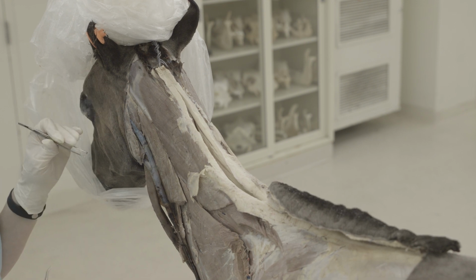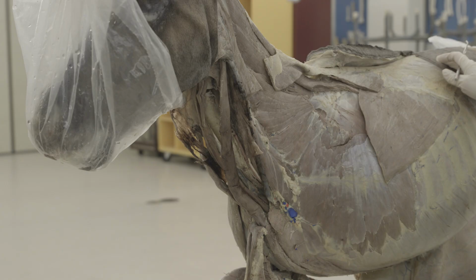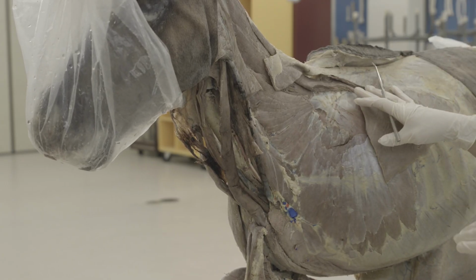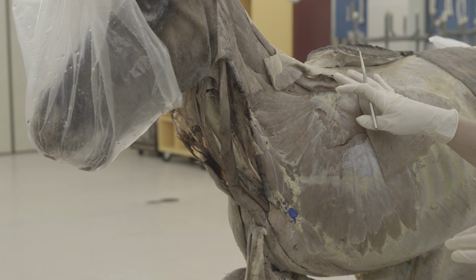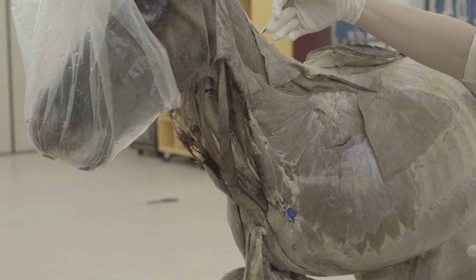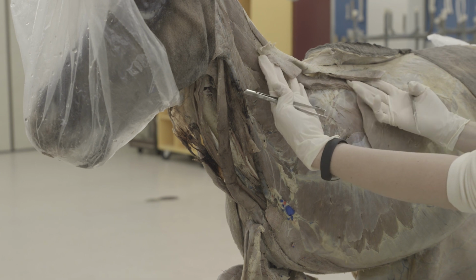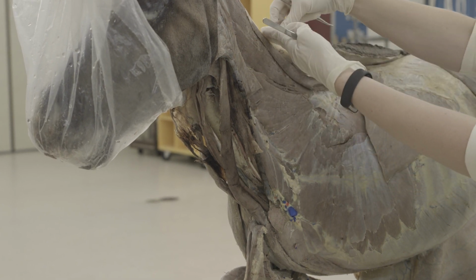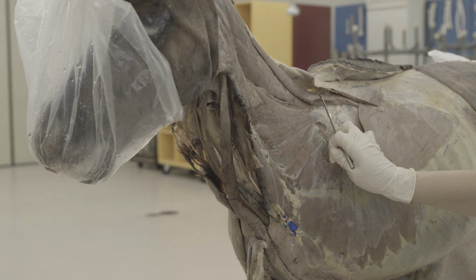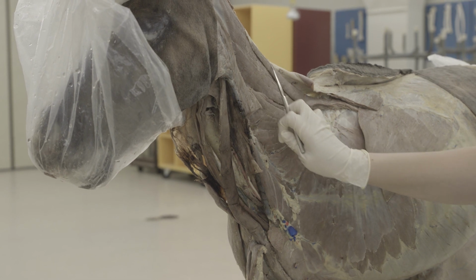Now we'll go back to the lateral side on the left and take a look at some of the muscles for this region. So here we are looking at the left side of the pony where you've detached that left limb. On this side, you'll be looking at stumps of the muscles rather than the whole muscles intact for some of these. But you want to find the stump of the trapezius muscle, so that was cut to remove the limb. So you have cervical trapezius here. And then you have rhomboideus underneath that, so cervical rhomboideus muscle right there.